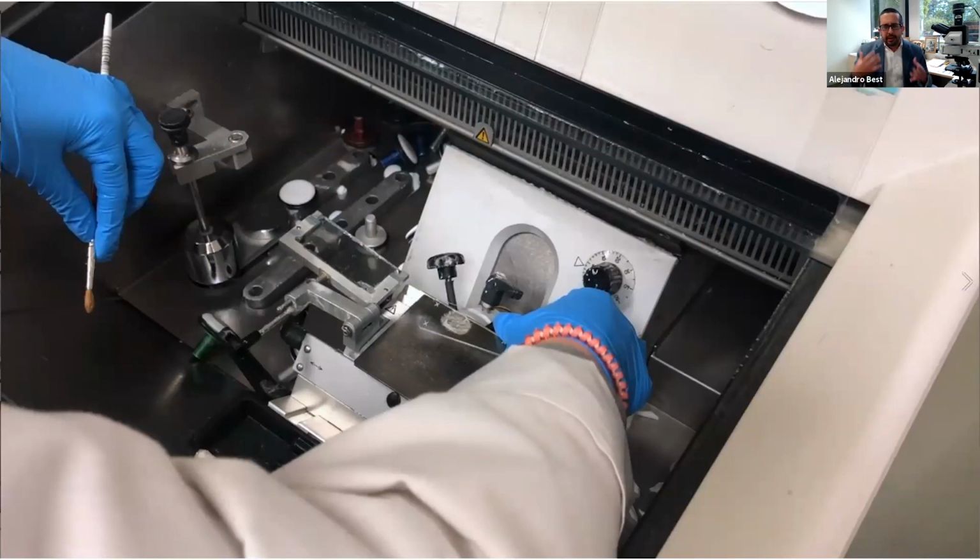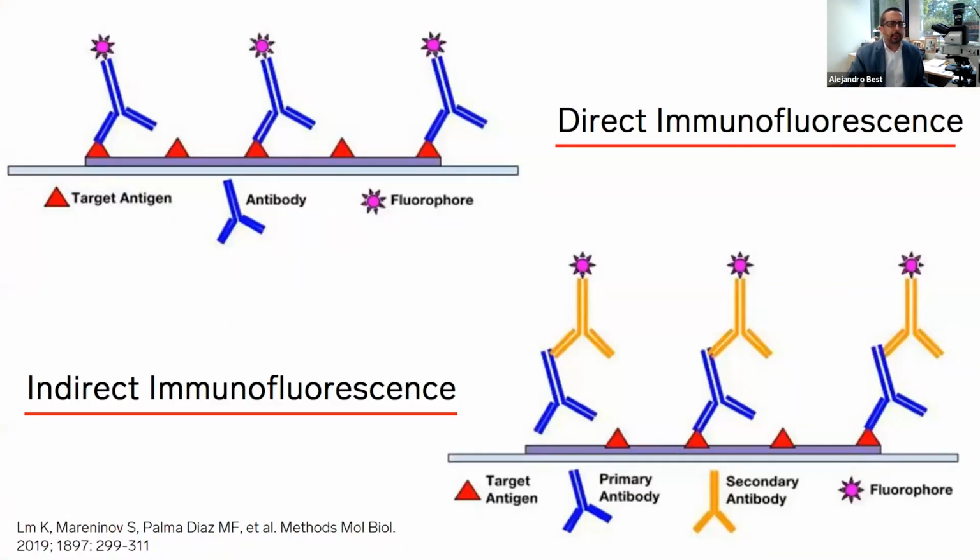Every lab is different, right? Here at Arcana, like I said, we start picking up tissue really superficially because we don't like to waste any tissue. So we collect slides for all our stains, and then we go back and do a deeper level on the same slide, again for all the stains. That way, on each stain, you have a superficial and a deep level, and the chances of missing the lesion decrease significantly with that approach. Anyway, after we have our slides ready, now we're ready to stain them.